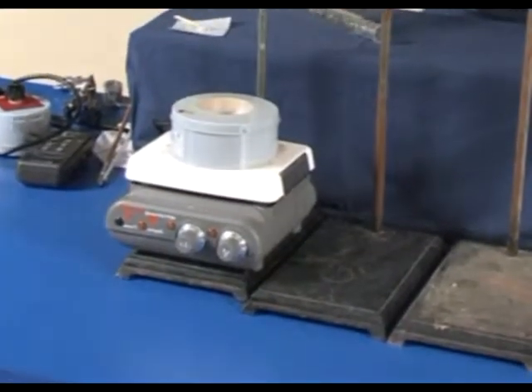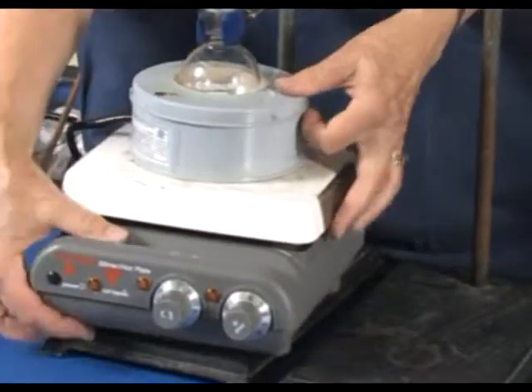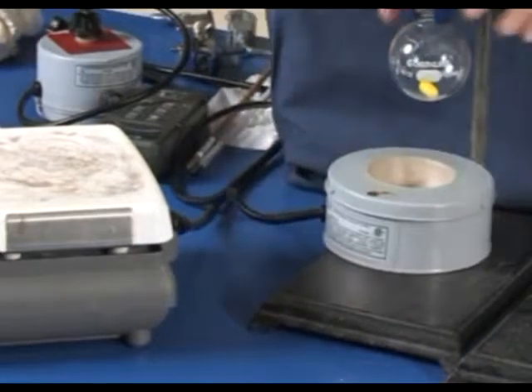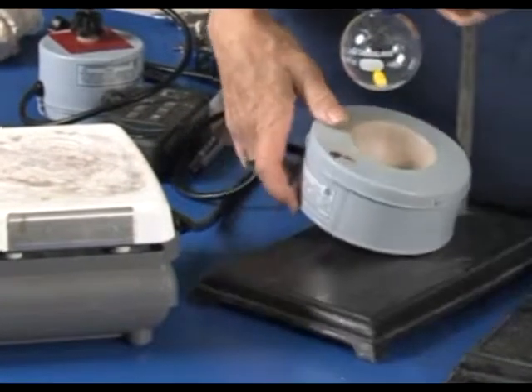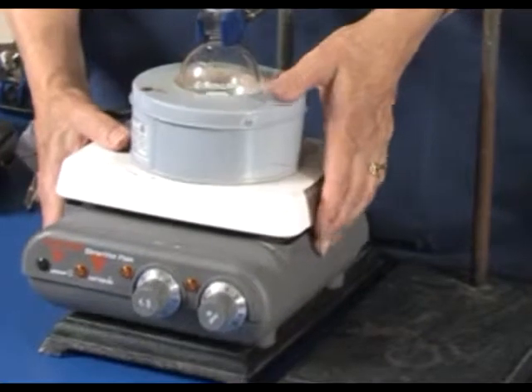Remember, use only the stir function on the hot plate. The heating source is from the mantle. When you have finished the distillation, remove the heat source from the pot using the emergency shutdown procedure shown earlier. Because the mantle will be hot, use the towel in your locker as a heat pad. Set the mantle either back on the hot plate or on a heat-resistant surface such as a ring stand. Do not set the mantle on the countertop.